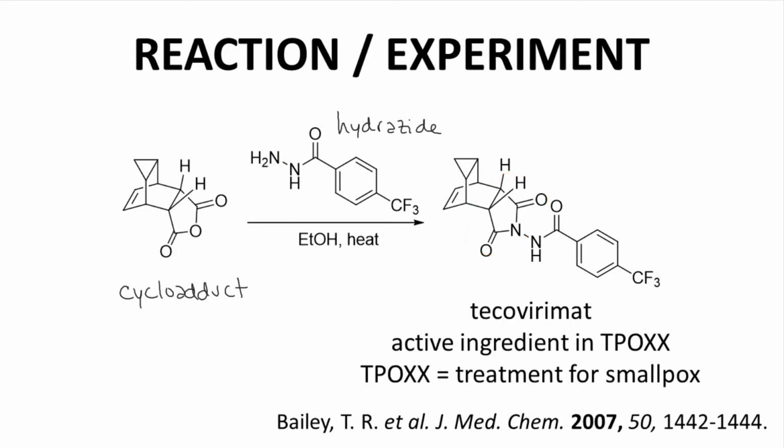This imide, which has a special name, tecovirimat, is notable because it is the active pharmaceutical ingredient in the antiviral drug TPOXX. TPOXX is a treatment for smallpox. We will talk about the pharmaceutical aspects of the product after the synthesis part of the video.